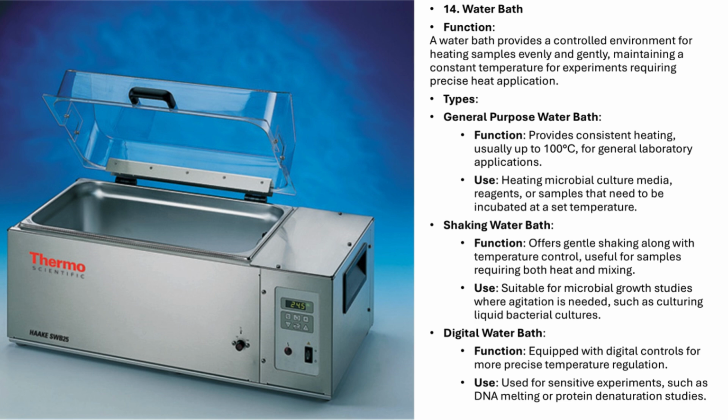Water bath, controlled heating for microbiological experiments. Let's dive into an essential tool used in microbiology labs for controlled heating, the water bath. A water bath provides an even and gentle heat source, allowing you to maintain a constant temperature for experiments that require precise thermal conditions. Types of water baths.